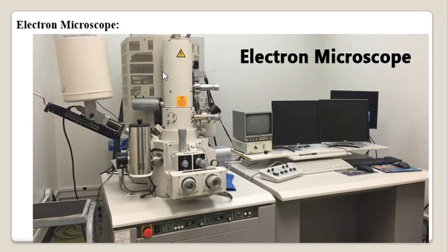Instead of that, in the electron microscope, condenser, objective and projector coils are used, right?